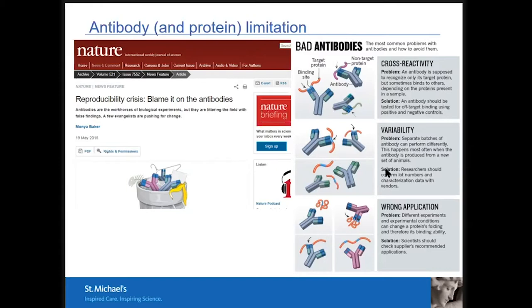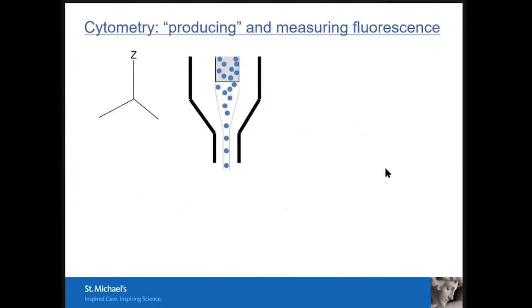So it can be very advantageous to say, look at CD3. CD3 is going to be fine. You're going to always find T cells on CD3. Whether or not you see certain other things or whether you have to move to a transcript is a totally different question. And there's not always antibodies available for the things that you want to look at. So if you want to look at one of those things, it's much easier to adapt something like a PrimeFlow assay and look at those things.